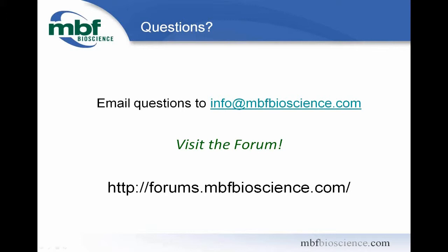Dana asks, what is the best way to transfer acquired data to a different workstation? Well, Dana, as we've already mentioned, we don't recommend you saving the acquisition directly to an external or networked drive. But once these image files are saved onto your local hard drive, you simply move the data file, the DAT file, and all the image files together to your workstation computer. There, you will open your DAT file, and the software will either prompt you to point out the folder where the images are at, or it's possible that your software and your DAT file and your images are in the same folder, in which case the program will find them there.